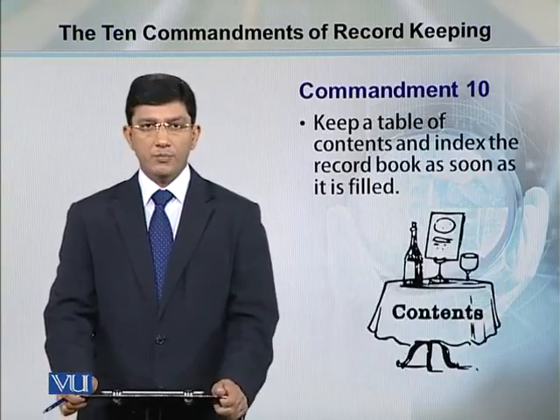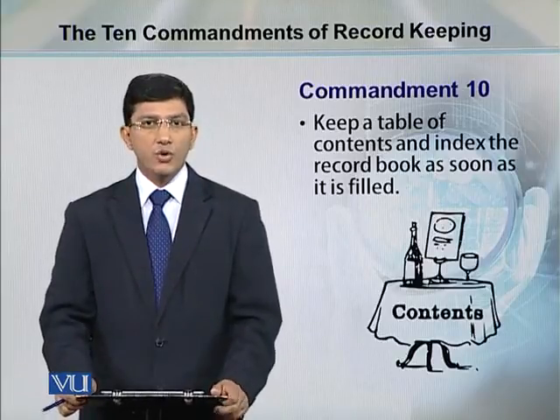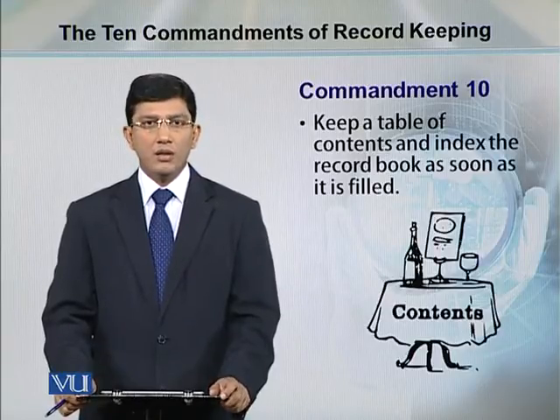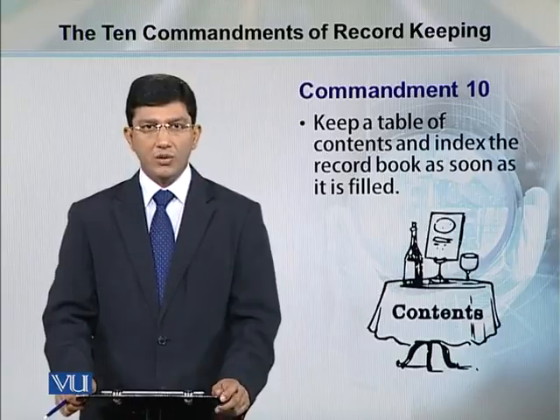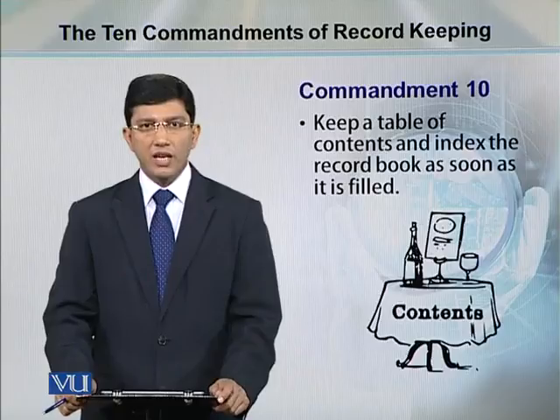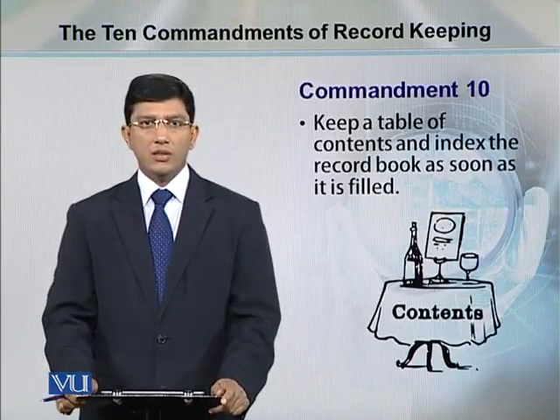Commandment number 10. Maintain a table of contents of the notebook. As soon as you complete an experiment and all the steps have been completed in data recording or in keeping the data in the notebook, list that experiment along with the date and page number in the table of contents.